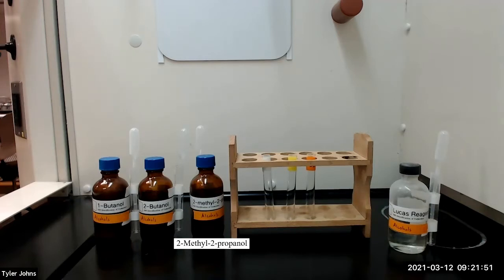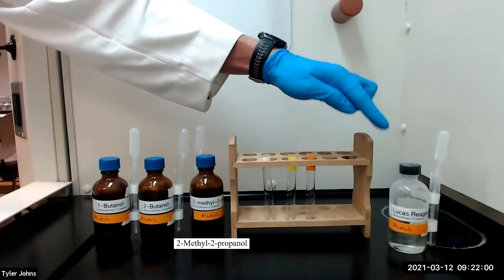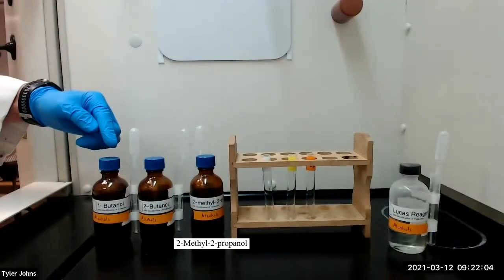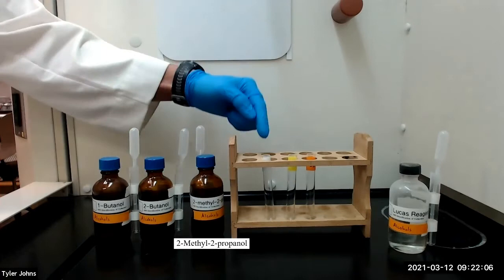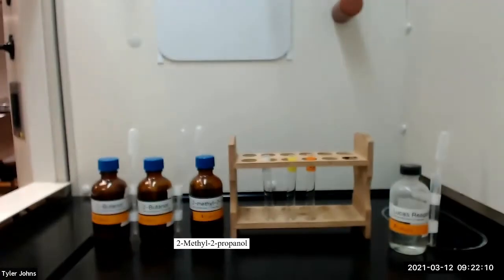The Lucas test does not work well with solid alcohols or liquid alcohols containing six or more carbons. We will begin by placing two milliliters of the Lucas reagent in three separate test tubes. We will then add three to four drops of the alcohols into the corresponding test tubes. We'll stopper the test tubes and shake vigorously.